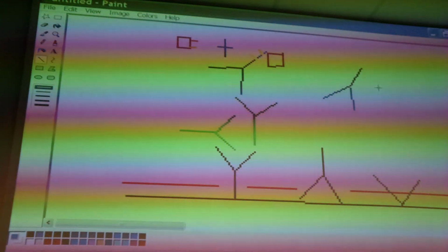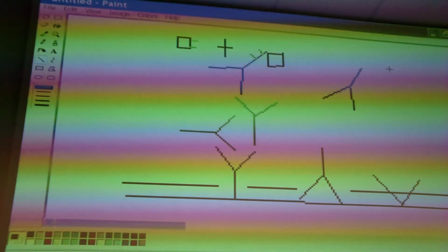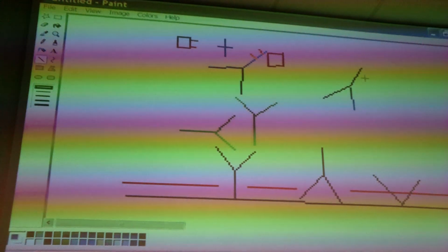If the gold antibodies are around, and this one wants to bind to gold, maybe I should use black, then it will do this in solution. You follow? If this one has a tendency to bind to the black antibody, by using a lot of black antibodies in solution, you will prevent it from sticking to the surface. It will do the binding in solution already and get washed away.